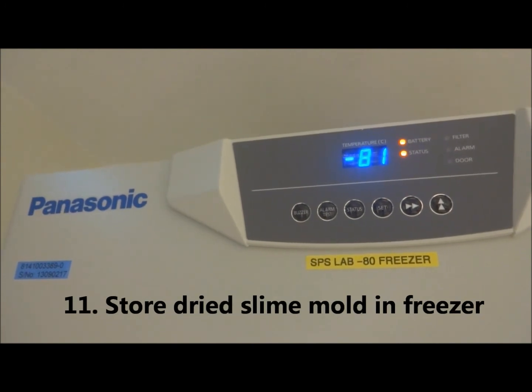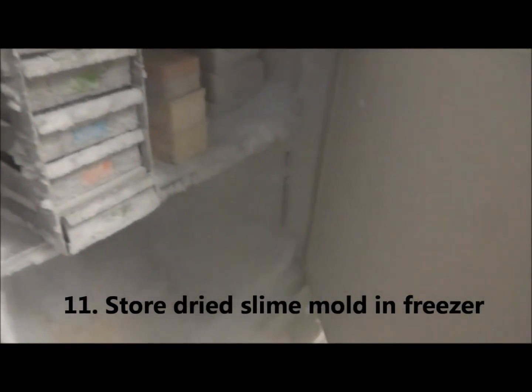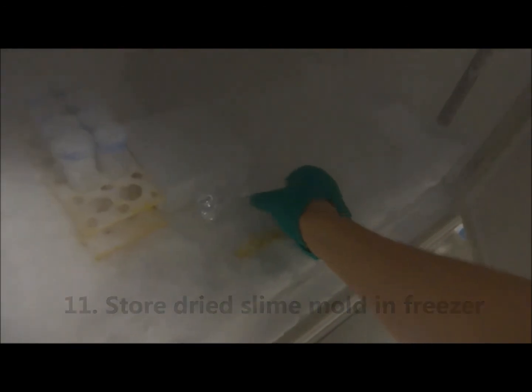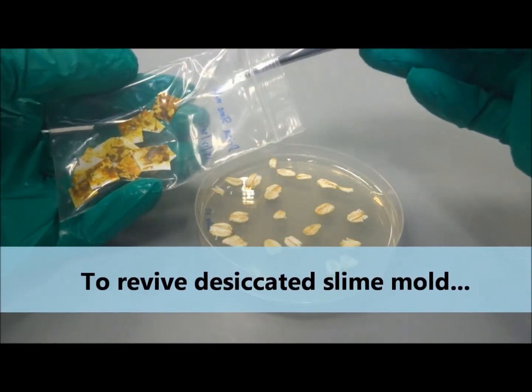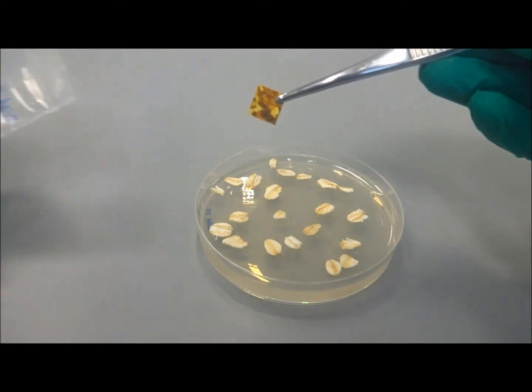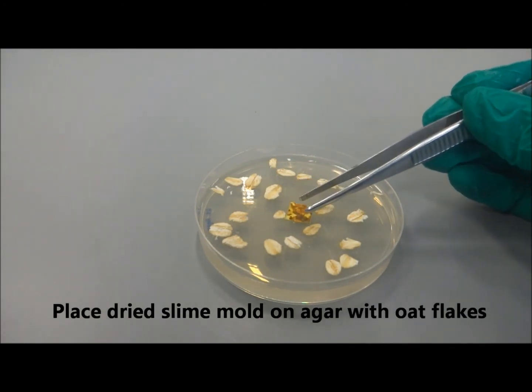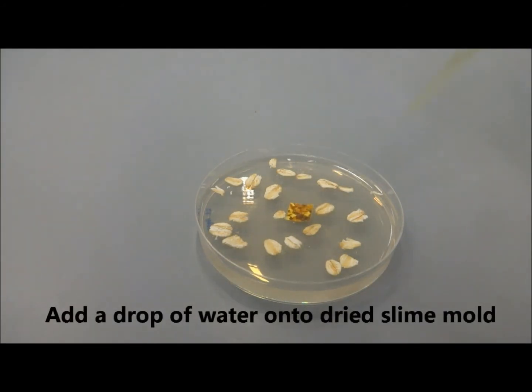Keep the dried slime mold in the freezer. If you wish to revive the slime mold, simply take one piece of the dried slime mold and place it on a new agar plate with oat flakes. You may add a drop of water onto the dried slime mold.